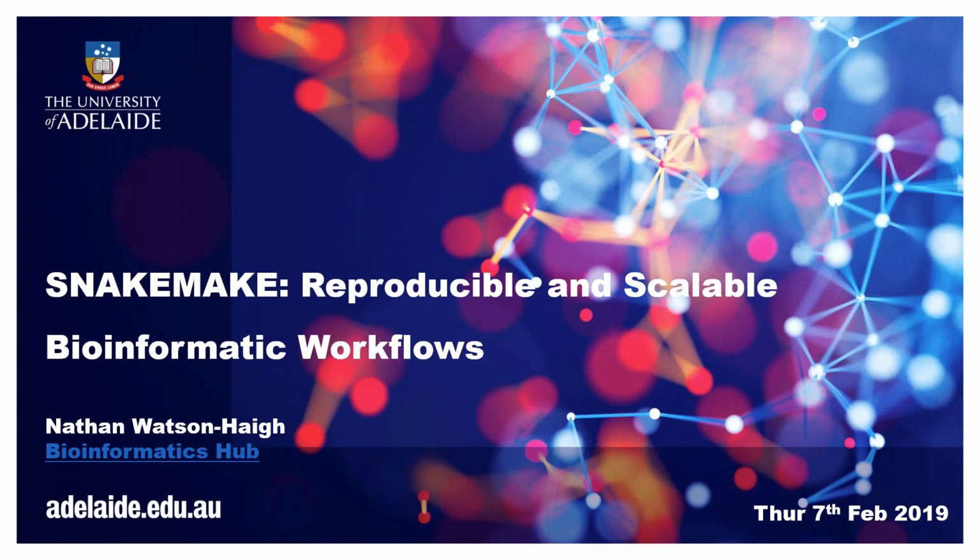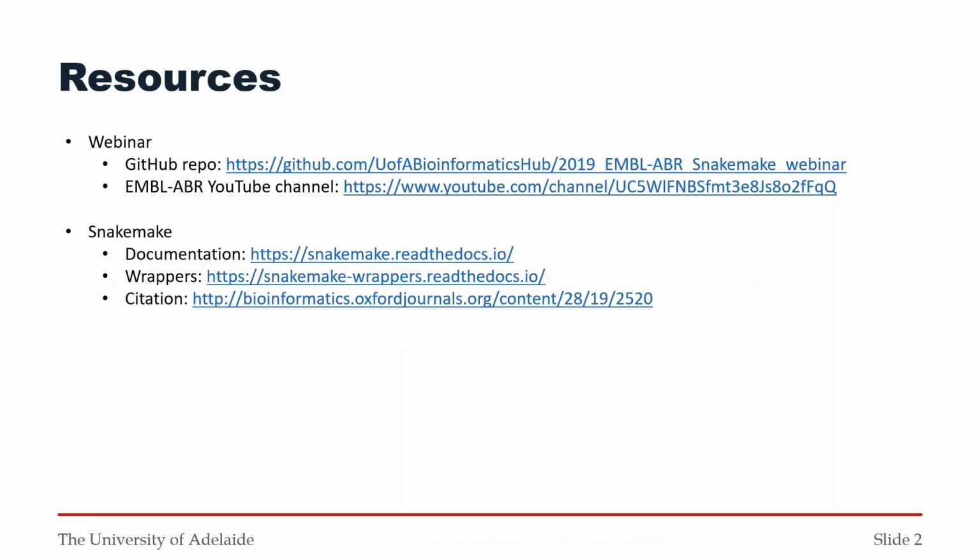So today I'm going to talk about Snakemake, reproducible and scalable bioinformatic workflows. This here is just a bit for posterity, really, and a link to a GitHub repository with the PowerPoint, as well as code that you can use after this workshop, potentially to work through some of the examples that I'll be presenting today.